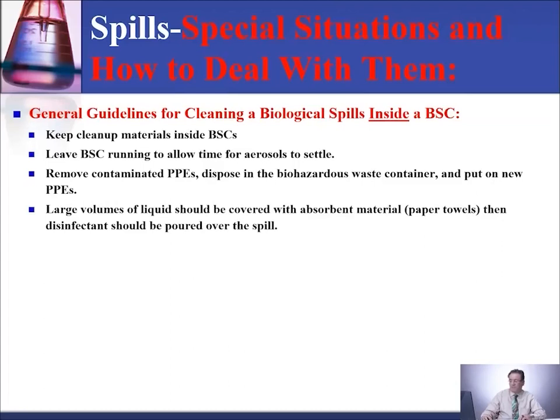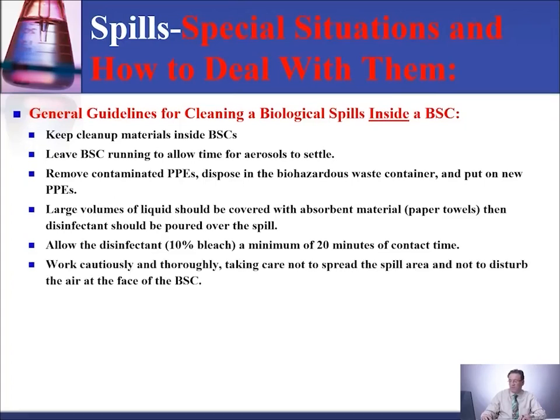Large volumes of liquid should be covered with absorbent material or paper towels. Then disinfectant should be poured over the spill. Allow the disinfectant, like 10% bleach, a minimum of 20 minutes of contact time.